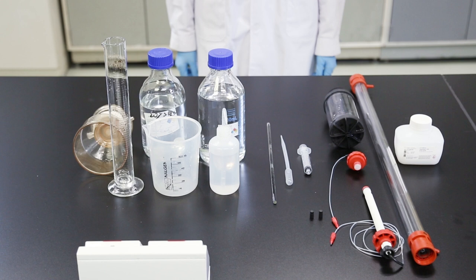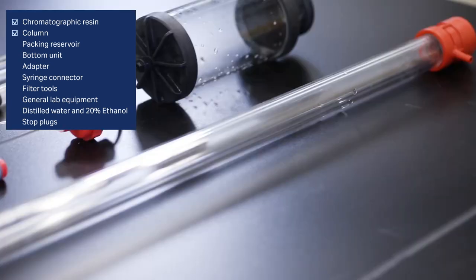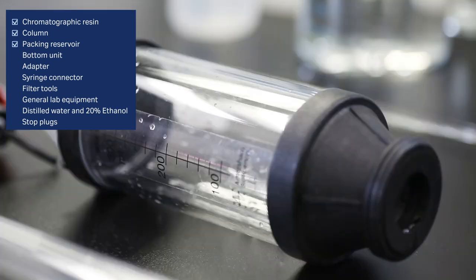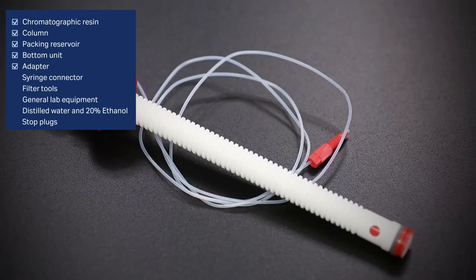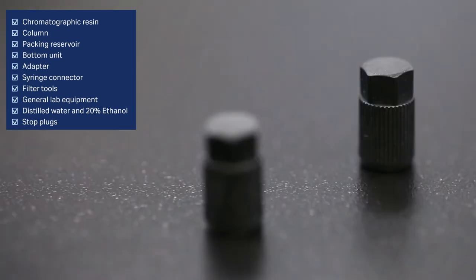Before initiating the packing of any chromatography column, make sure you have all the proper components in order. To pack the column, you will need the resin, a column, a packing reservoir, the bottom unit, the top adapter, a syringe connector, and general lab equipment. You should also have distilled water and 20% ethanol and column stop plugs.